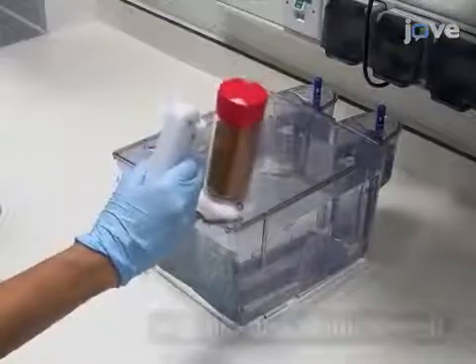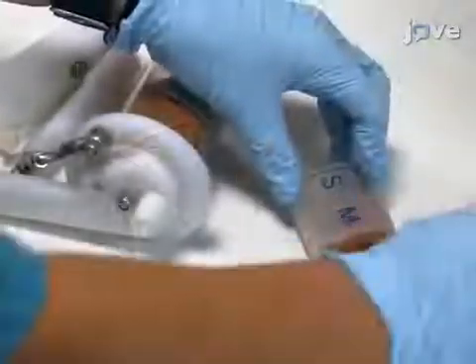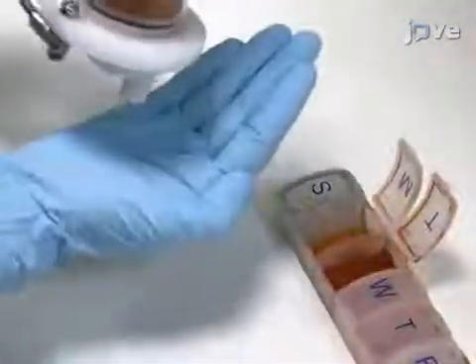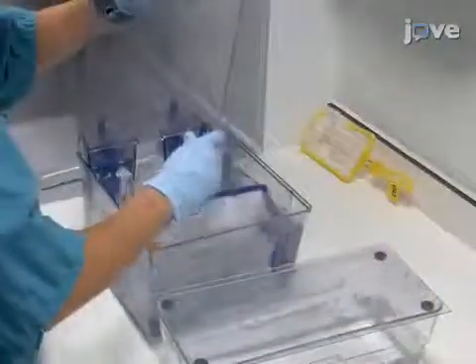Feed the fish once a day. Vary the diets to make sure the sentinels are exposed to all the diets used in the zebrafish facility.